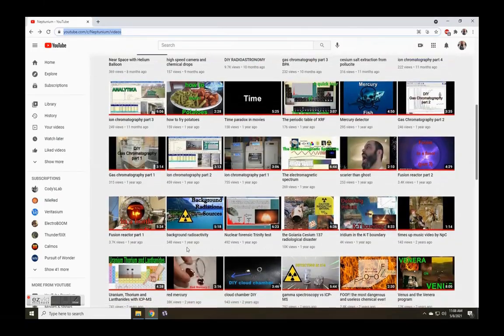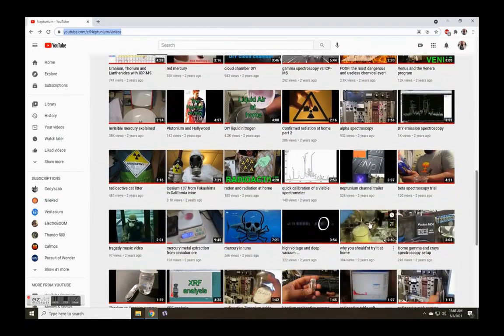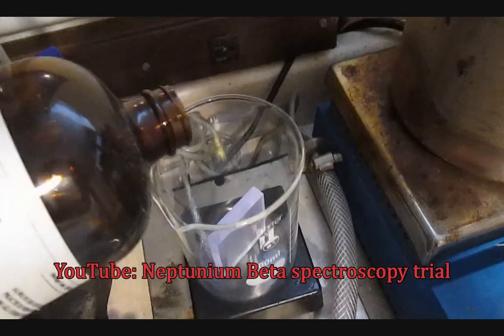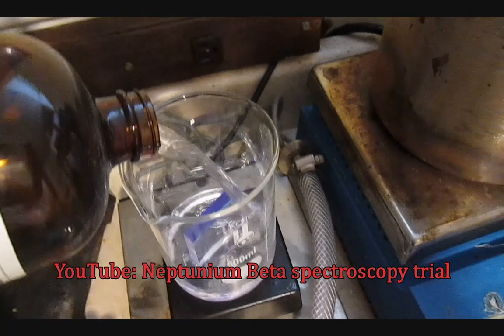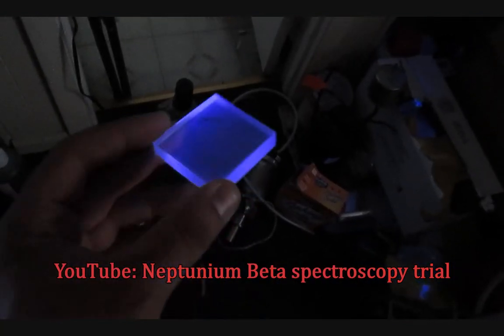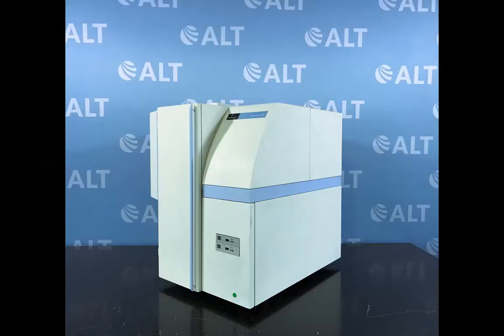These radionuclides are usually picked up by a liquid scintillation counter, and I tried before. About three years ago, I dissolved a chunk of plastic scintillator in toluene, hoping to make my own liquid scintillation counter, and failed. So it was time to get serious and invest in reliable equipment.